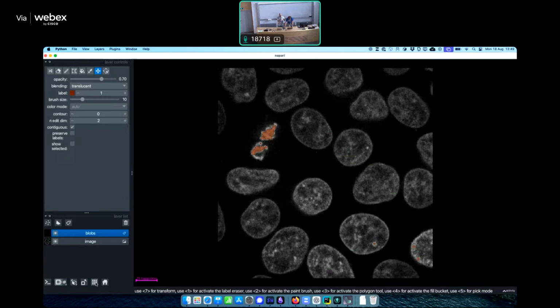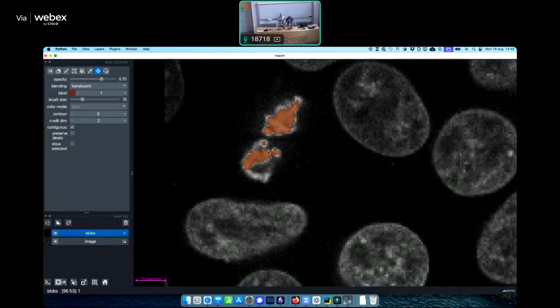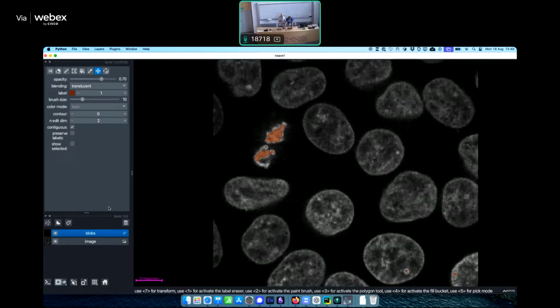As you can see, our blobs, which is the labeled data, we just got the highlights over there. It's now in brown. And of course, when you get to this point, you run your function and you're like, okay, clearly the parameters are wrong. I need to change the threshold. So you go in and type a new threshold, then run it again, and hopefully find a good threshold. Or you have to find some smart way of guessing the threshold correctly. But it would be nice if you could just do it on the fly.